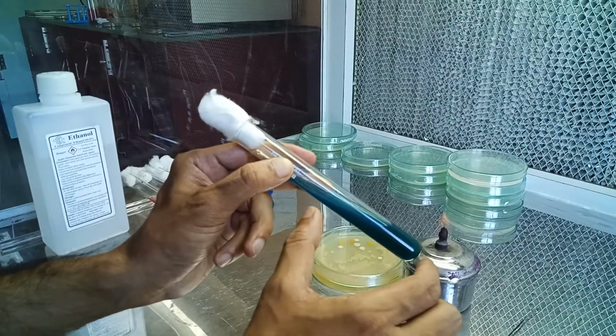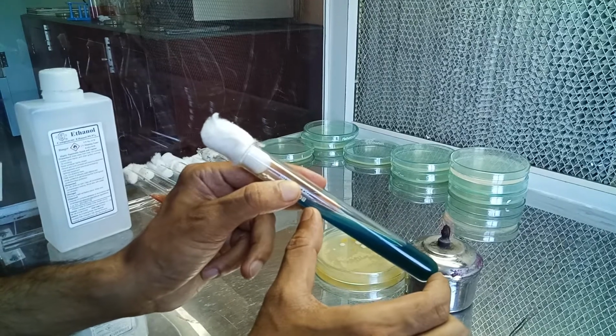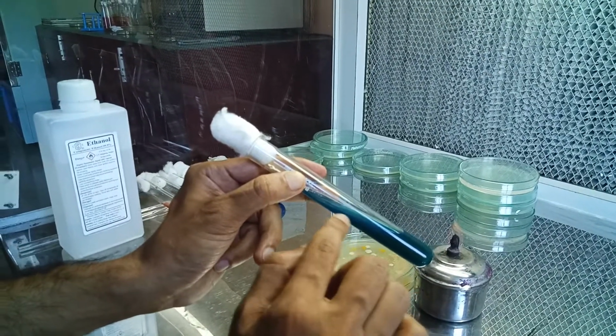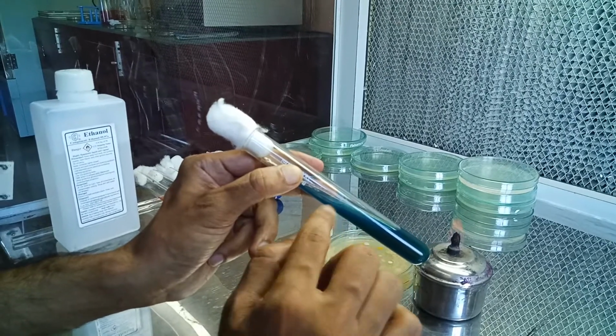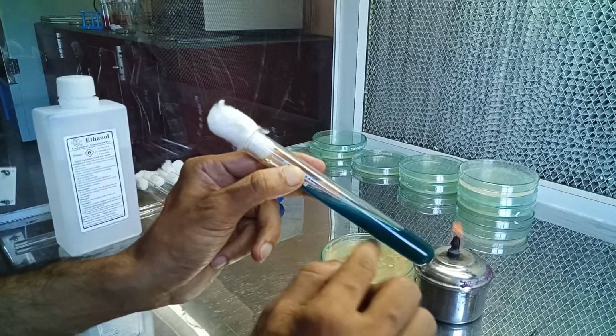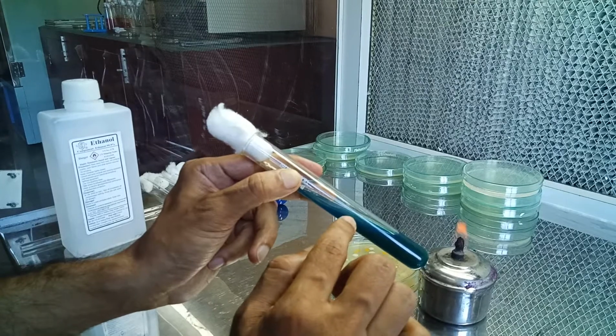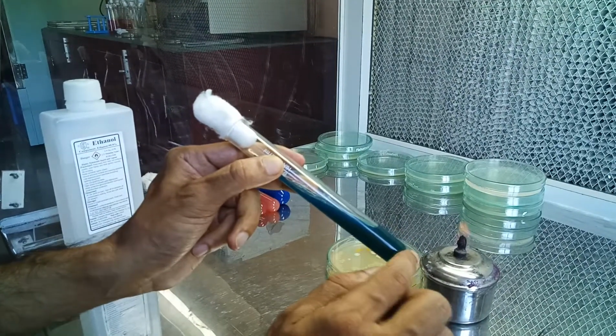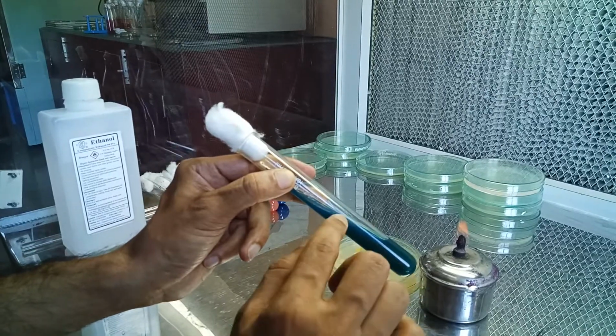Now sodium carbonate is an alkaline substance, so the pH of the medium changes to alkaline, and then the color of the medium becomes blue. So change of the color of the medium from green to blue is indicative of a positive result, and if the color remains green like this, then that is indicative of a negative result.